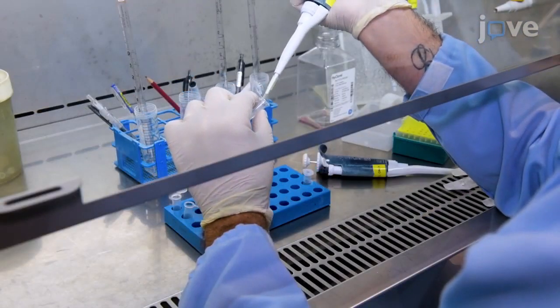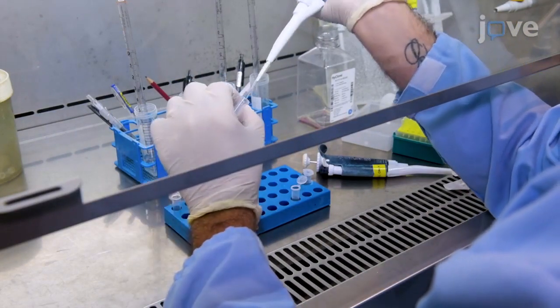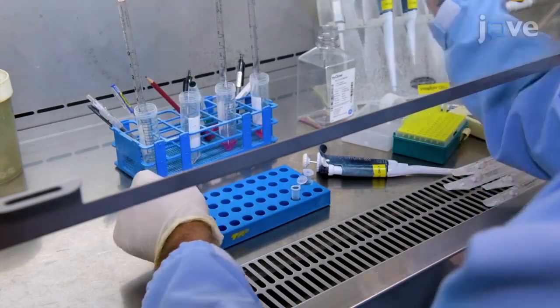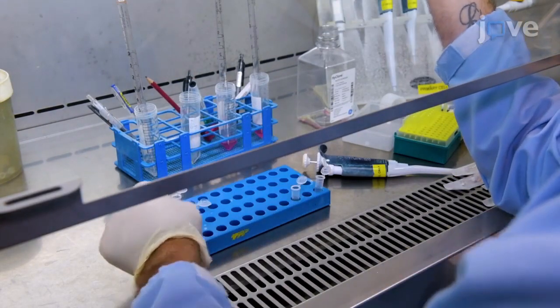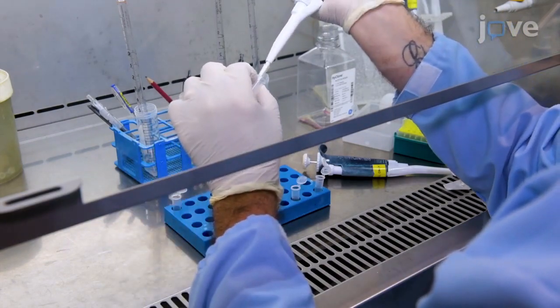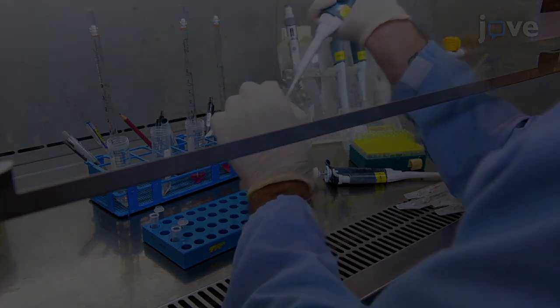While the diluted liposomes incubate at room temperature for 5 minutes, prepare the master mix of DNA by diluting 3 micrograms of each plasmid in 125 microliters of reduced serum medium for each transfection tube. Add 12 microliters of enhancer reagent.